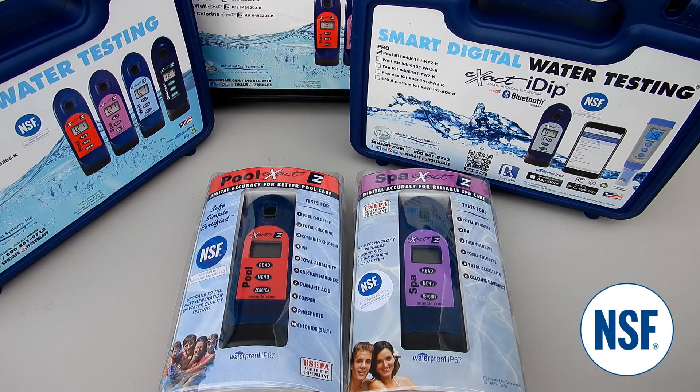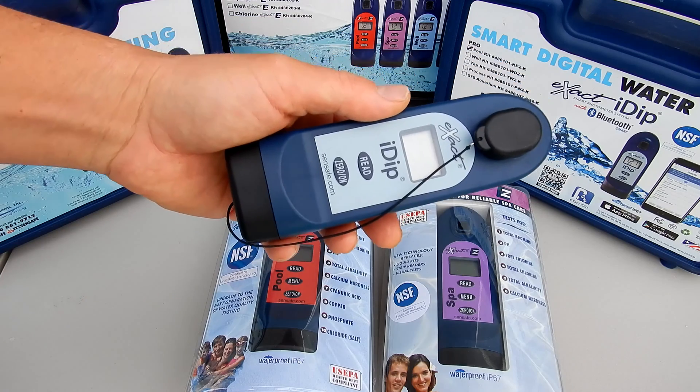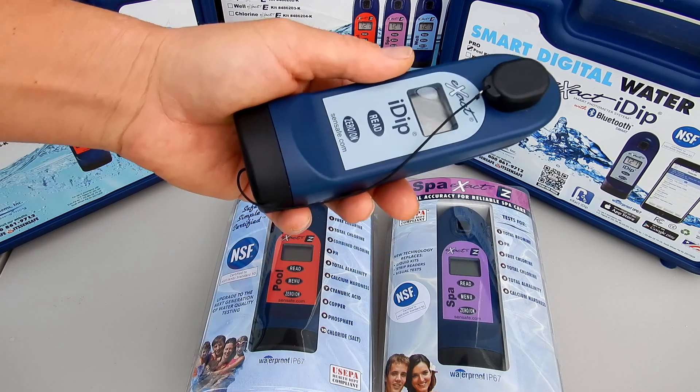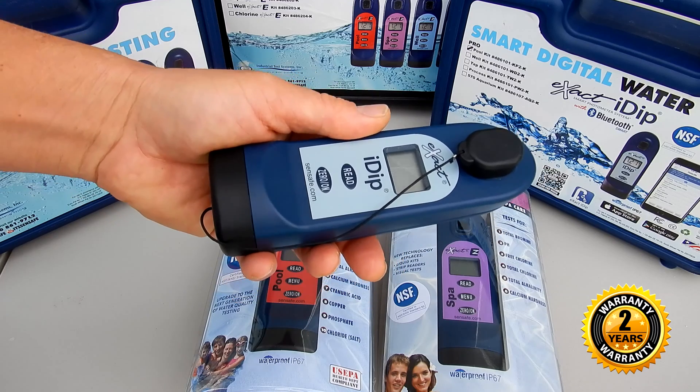All of the ITS exact photometers are made in the USA. They're also 100% waterproof and they come with a two-year manufacturer warranty.